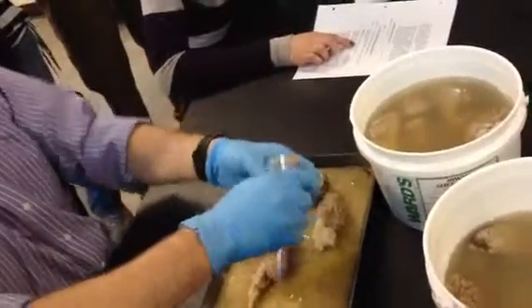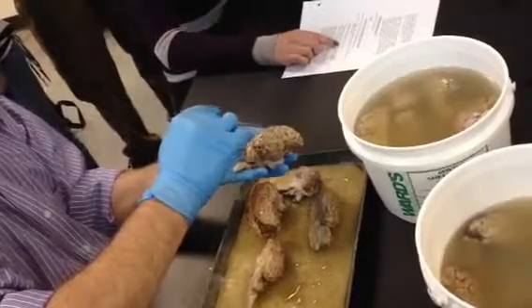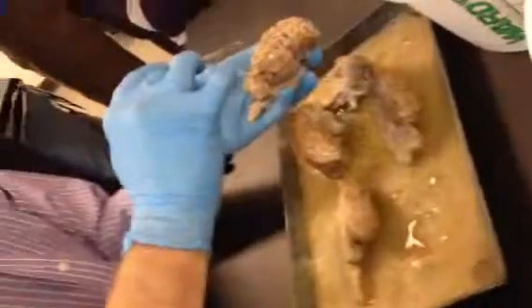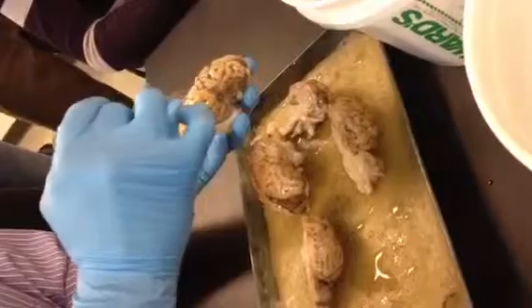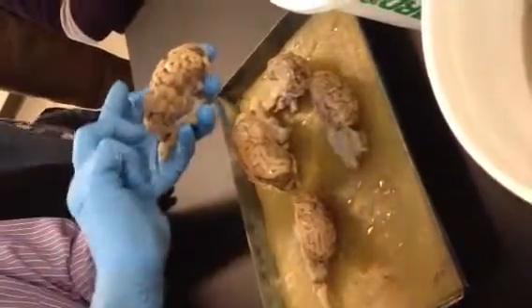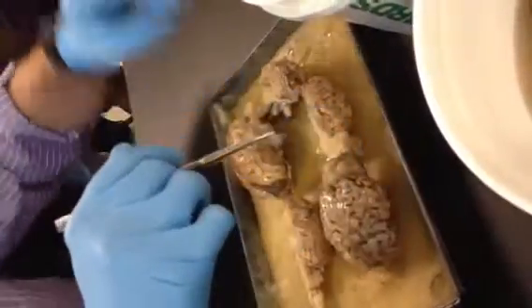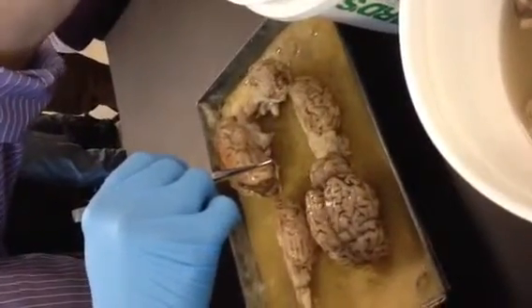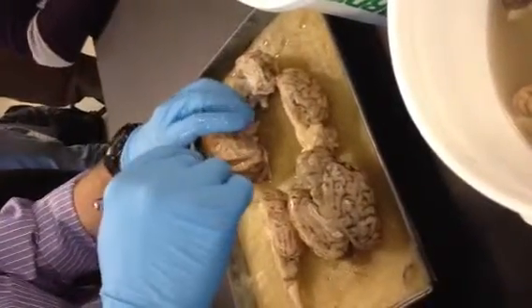Arachnoid. If it has the vessels, see these little dark vessels? They're located in the valleys. Then it still has the arachnoid layer attached to it. So just realize that. Still has the arachnoid. If we get this so it's all gone, or all these black lines are gone, then you know it's just pia mater. Because what happens is this dura mater kind of tents over the top of the valleys a little bit. I don't know if we have any here that have it removed, so I don't see it. After pia mater? Yeah, so we'll go to the next one.